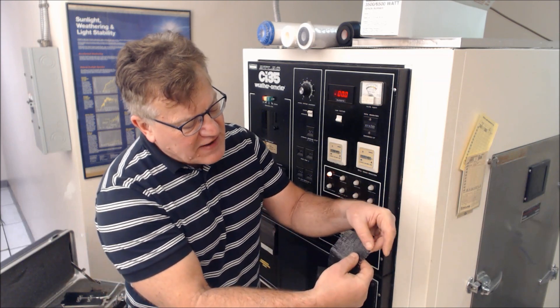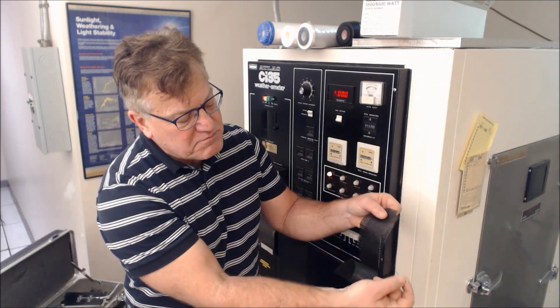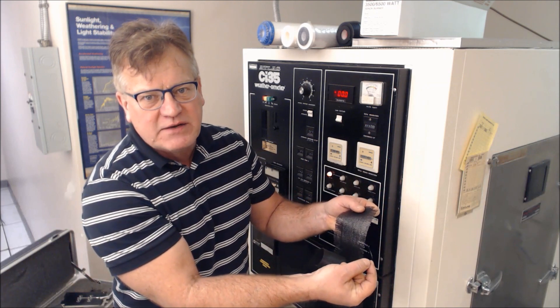The orientation of the fibers is very important. You can imagine that in the machine direction, if you're missing one of these fibers, it will be significant.